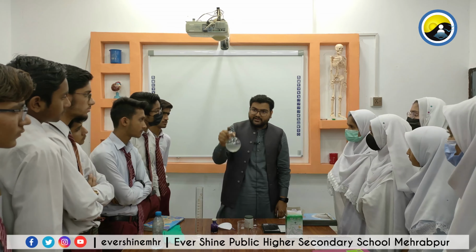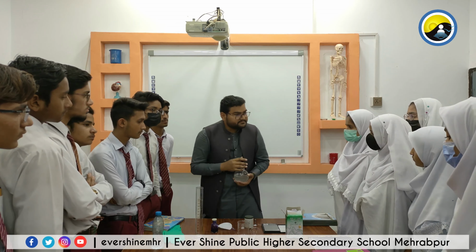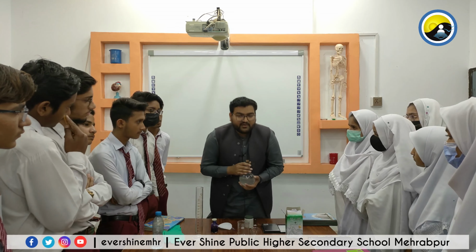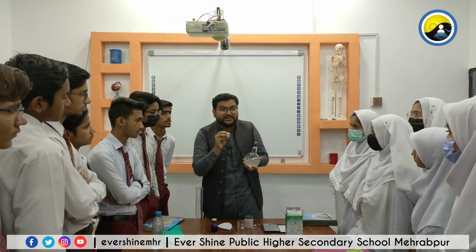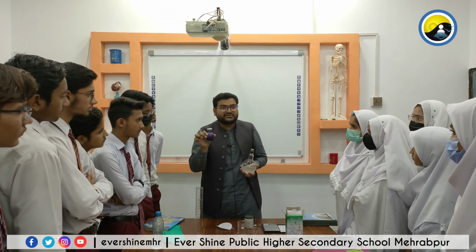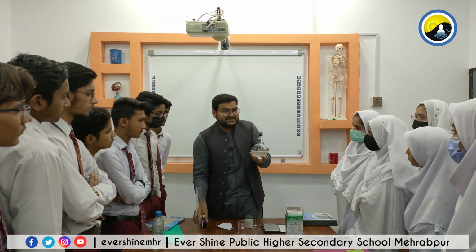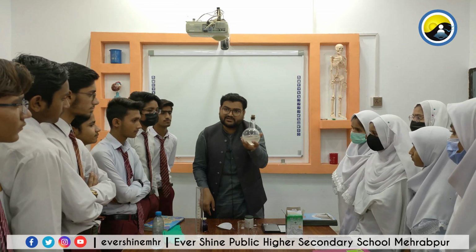If you have any questions regarding this experiment, you can ask. Sir, I have a question. Sir, why did the solution become colorless? It is becoming colorless because we have used glucose as a reducing agent, and when methylene blue is reduced, it becomes colorless. So glucose is reducing the methylene blue and our solution is becoming colorless.